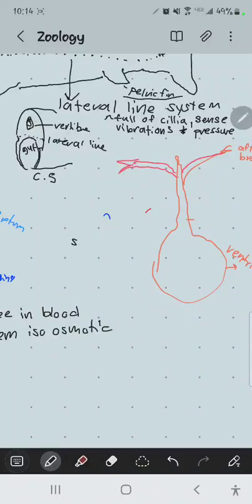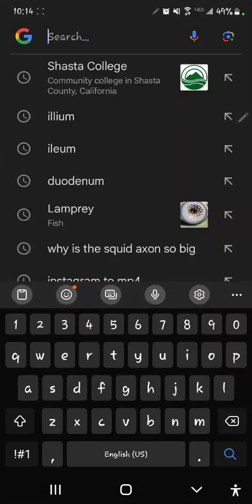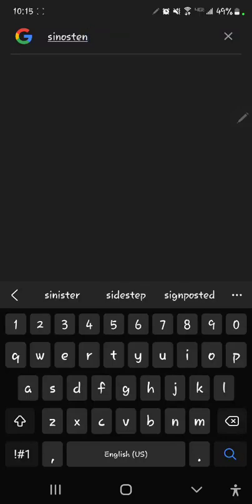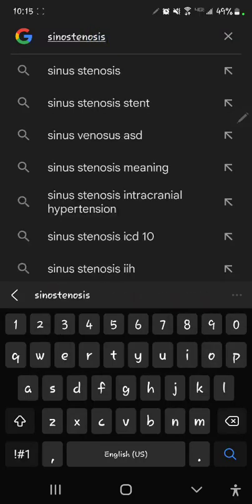I don't think I need to really draw it separately. I can just go ahead. That'd be good enough. So if I had heart questions in the test, we would ask about the ventricle versus the atrium versus sinus venosus. Probably wouldn't ask about the afferent branchioles.